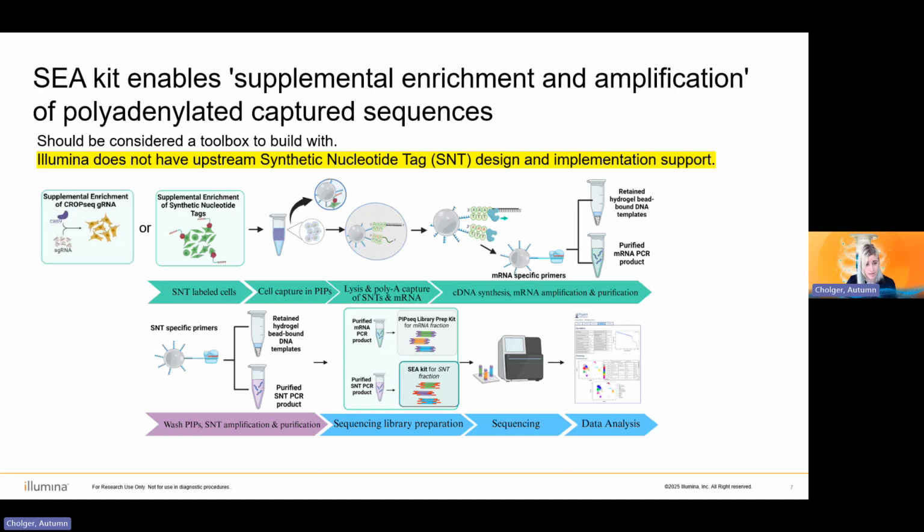But with a second set of primers specific to our synthetic nucleotide tag, we can go through a second round of amplification and a parallel library prep so that we can pool our gene expression library with our synthetic nucleotide tag library on the same sequencing run.